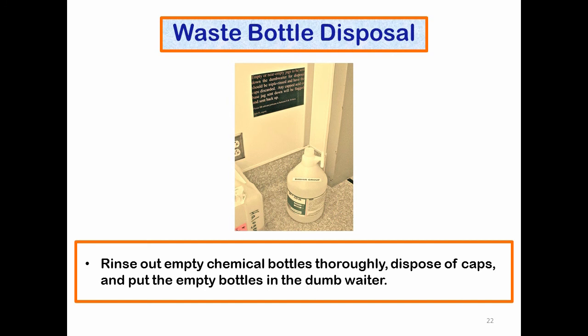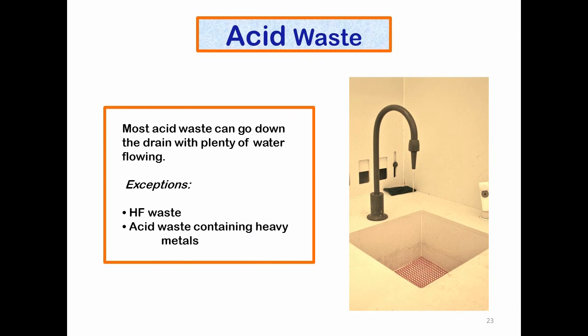Waste bottle disposal: do rinse out any empty chemical bottles thoroughly, dispose of the caps, and put the empty bottles in the dumbwaiter when they are rinsed out.